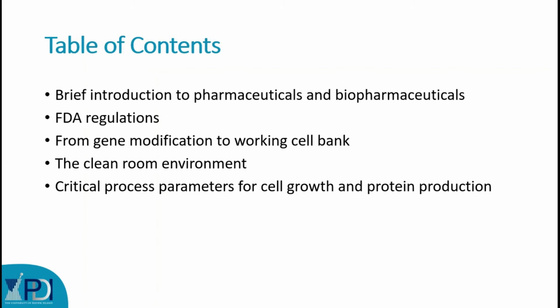Then we will discuss the clean room environment in which you will be working if you are working in upstream processing. And finally, we will discuss some critical process parameters for cell growth and protein production.